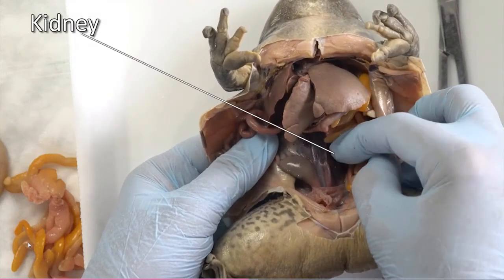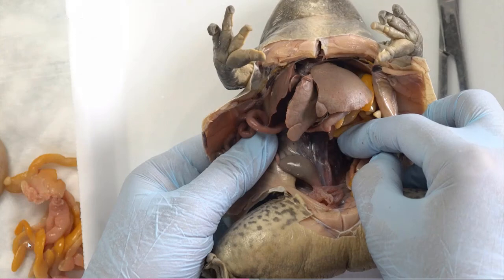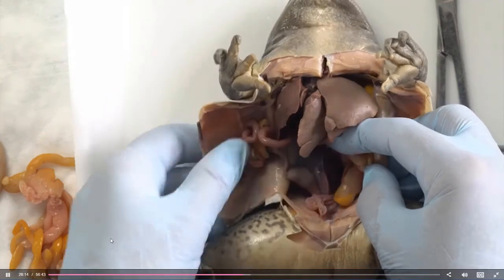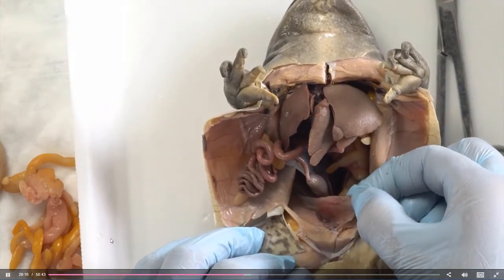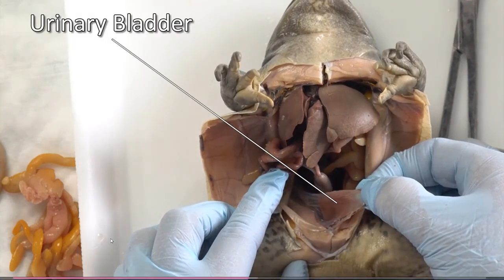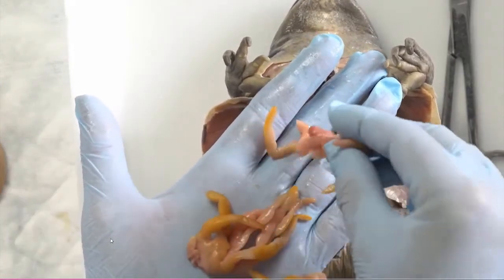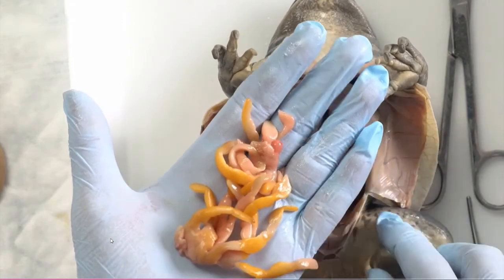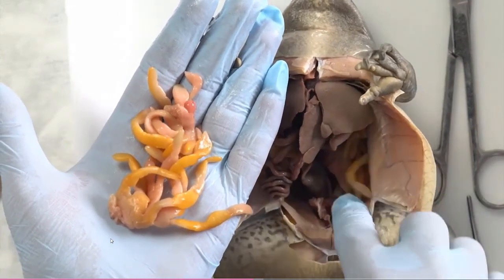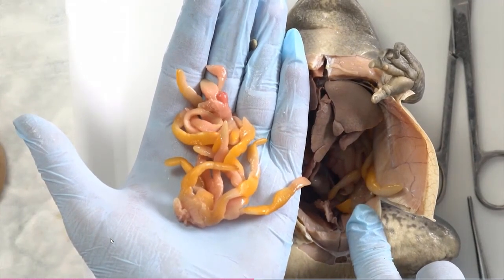Along the dorsal body wall is the dark, elongated kidney. Like the testes, these will be paired. If you're up for a bit of an adventure, you can actually tease this away and find the ureter, which will lead down into this sac right here, and that would be the urinary bladder, and that is present in the female as well. Here are those fat bodies that we removed. We can see their structure as being very flexible and inside the body cavity able to move around and insulate and protect those organs.